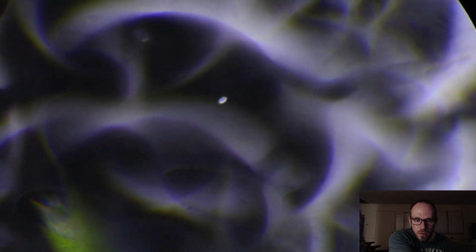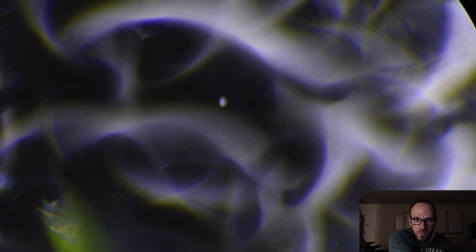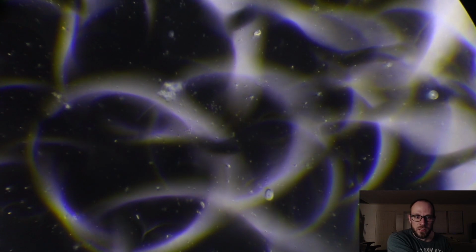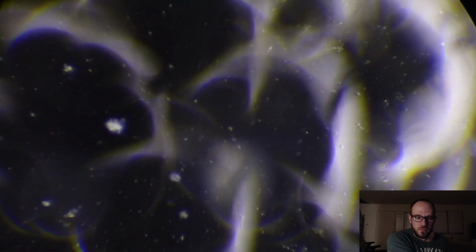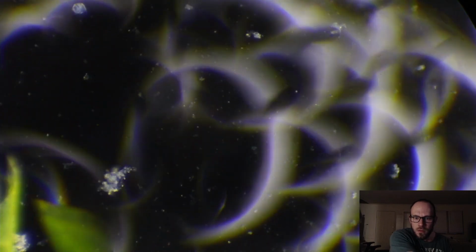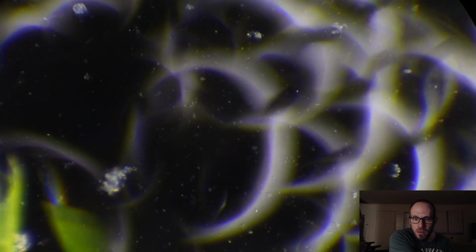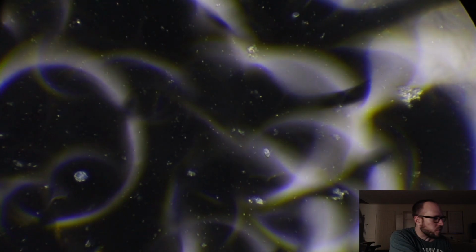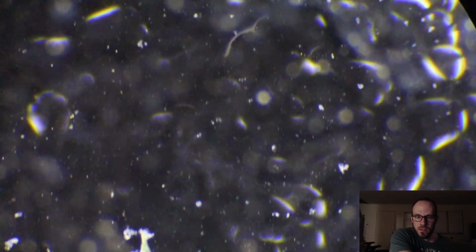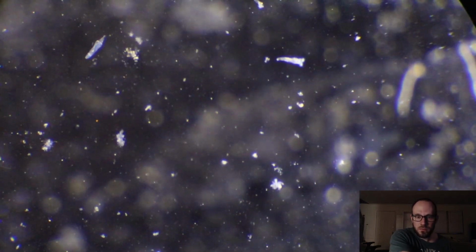Wait, what are you? Lots of stuff to look at. BRB, two ticks. Whoop. I'm surprised that this damn water is not drying up more quickly. Just stuff swimming everywhere.